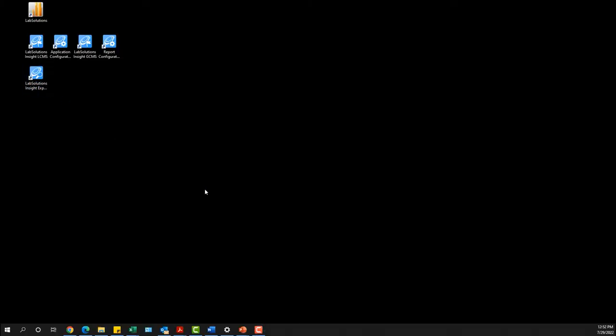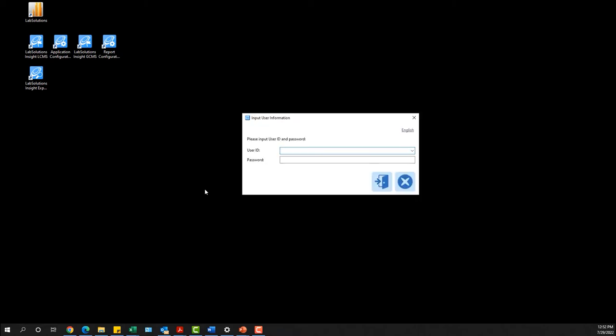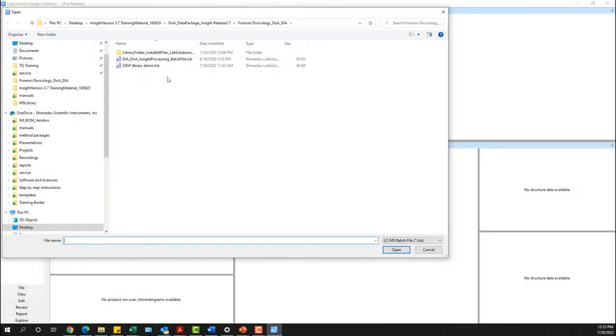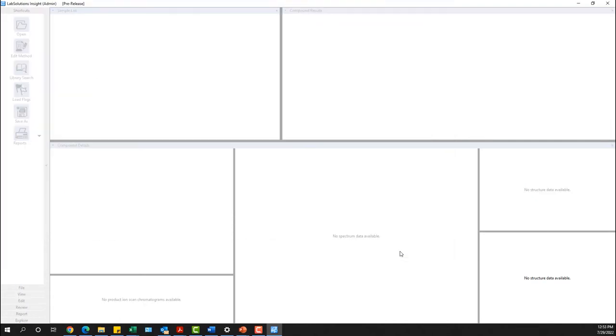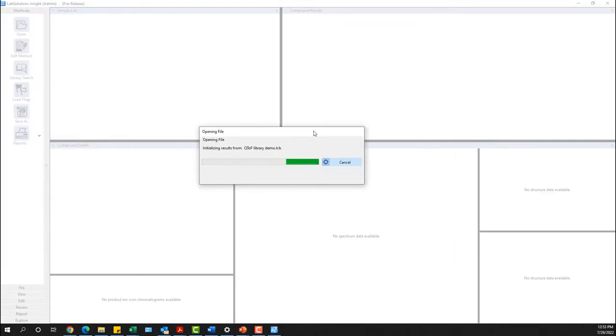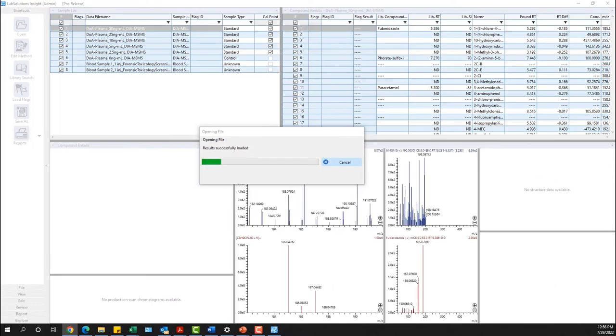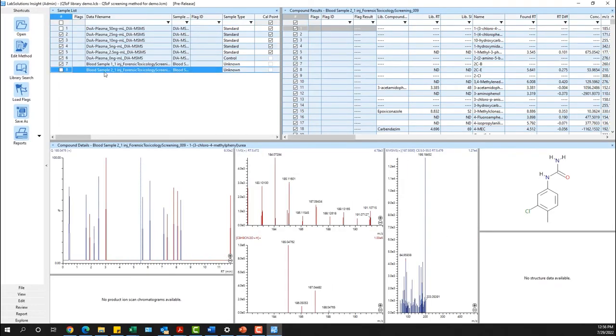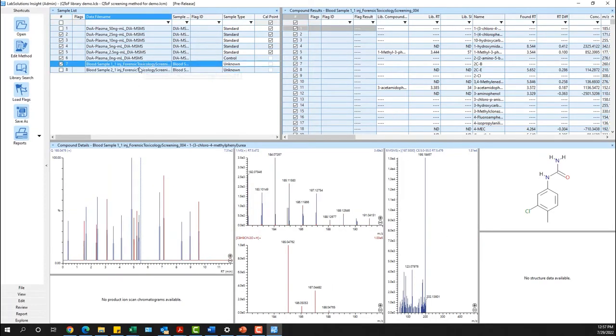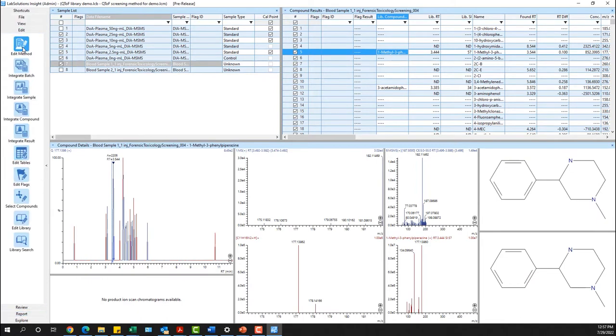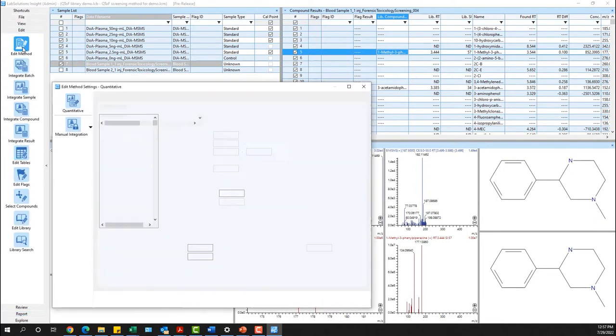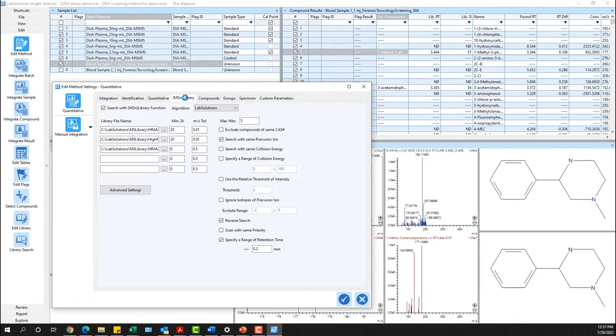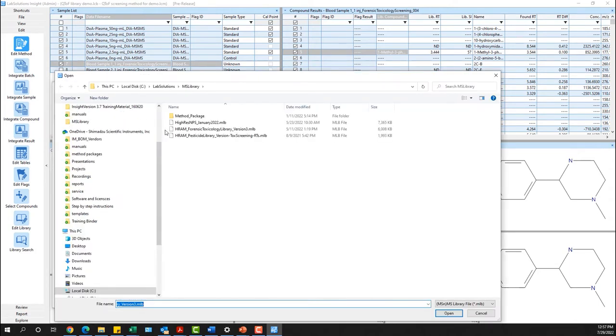Once logged into LabSolutions Insight Explore software, a single step is required to open the entire sample batch for review. Select Edit Method to set the desired search criteria and to check that the library file path is defined correctly.